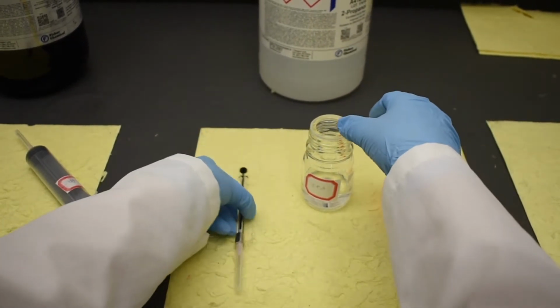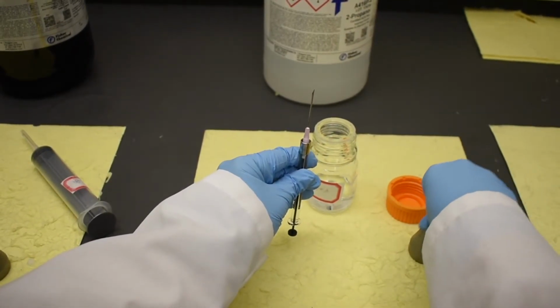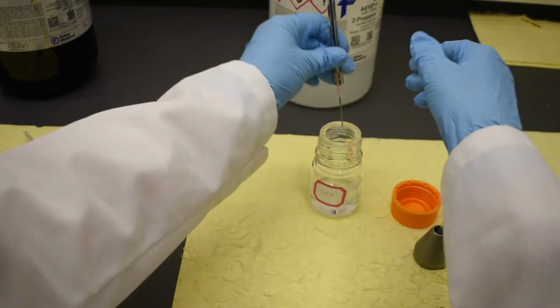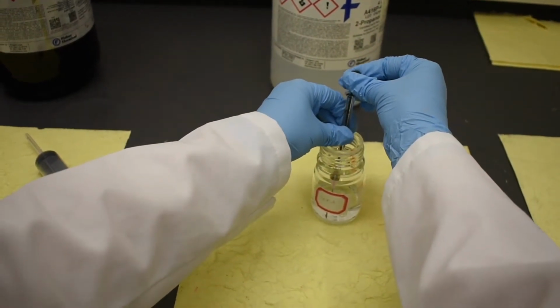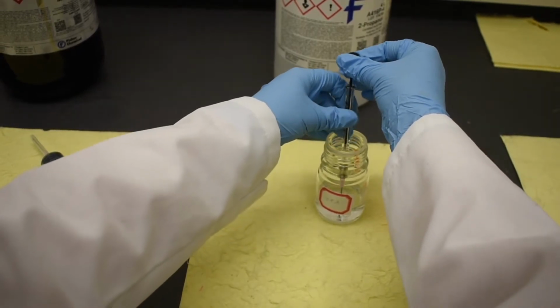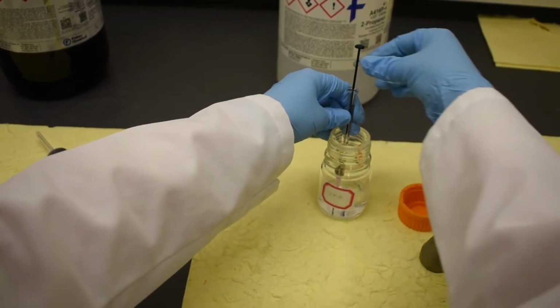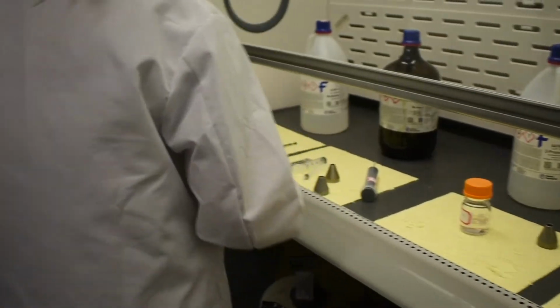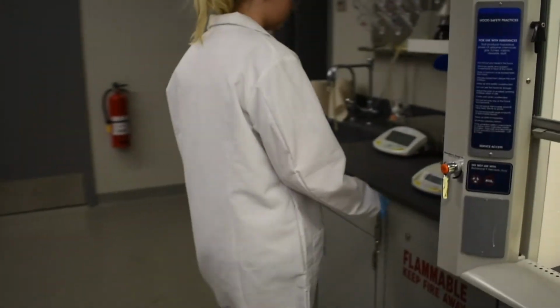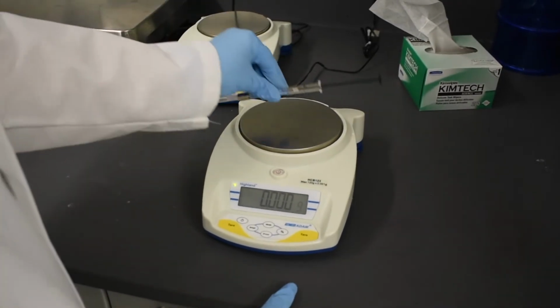Once the boiling solvent has reached its equilibrium temperature, the solute can be measured using a 2.5 milliliter syringe. Once again, recap the syringe. Next, mass the solute-filled syringe.